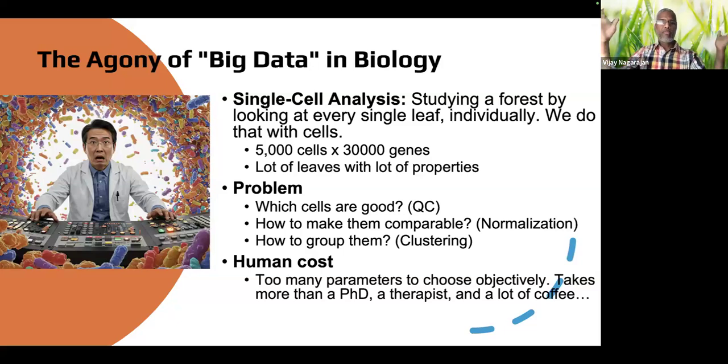It's a mind-boggling amount of research space that you can explore, with the data points that are there. So again, the parameter space is really too much. It's very hard to choose anything objectively. So usually individuals, based on their bioinformatics expertise and whatever they have seen throughout their analysis experience, try to use that, sometimes based on the reference. But it becomes subjective, right? Very hard to reproduce, and there are issues that come along with that.